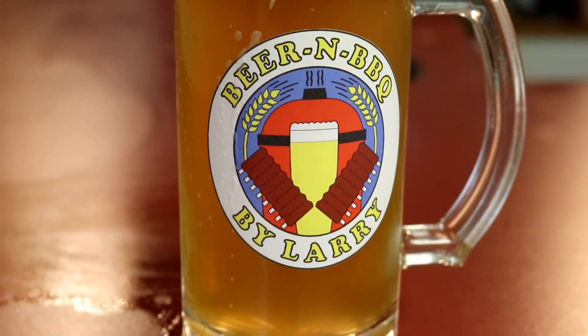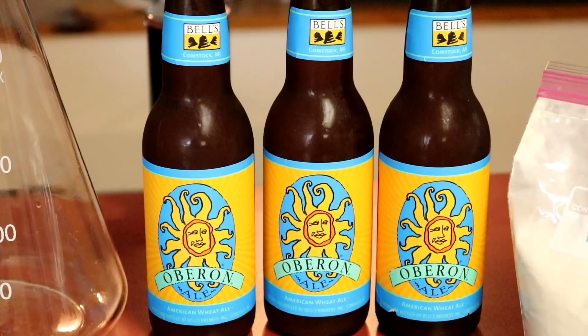I recently made a clone of a popular beer by using yeast cultured from a bottle of that popular beer. If you want to see more about it, stick around.